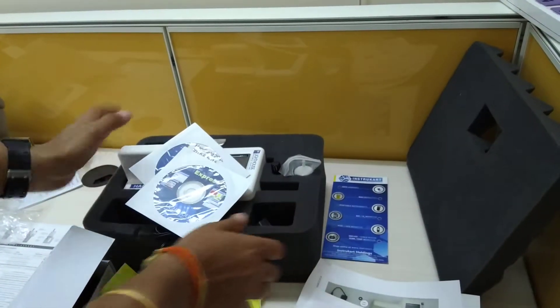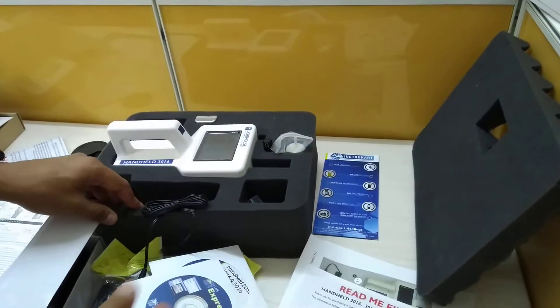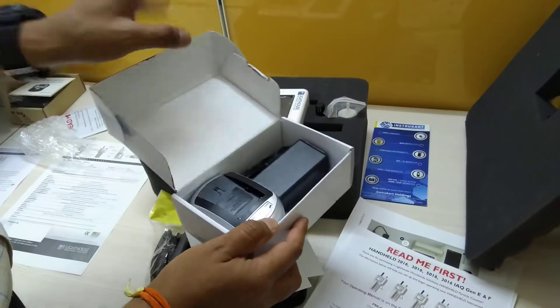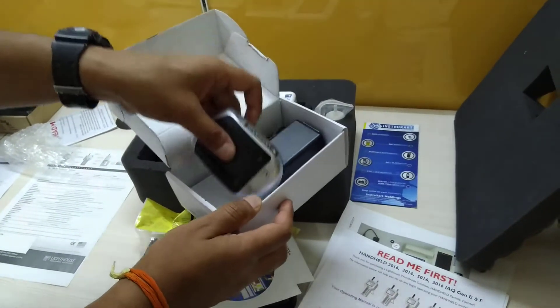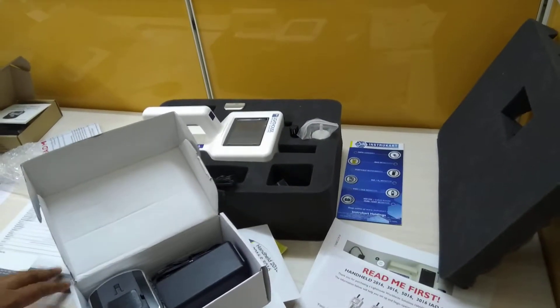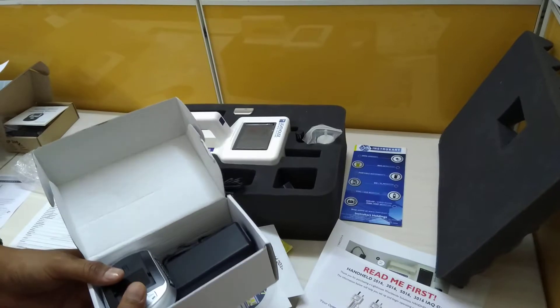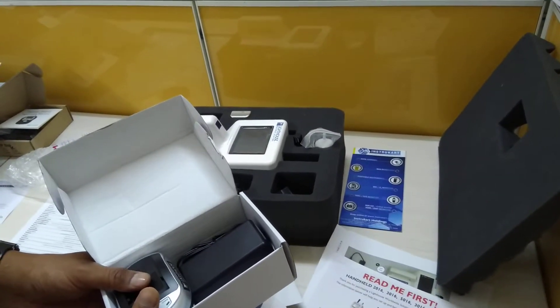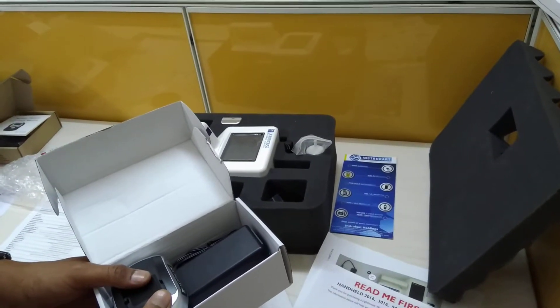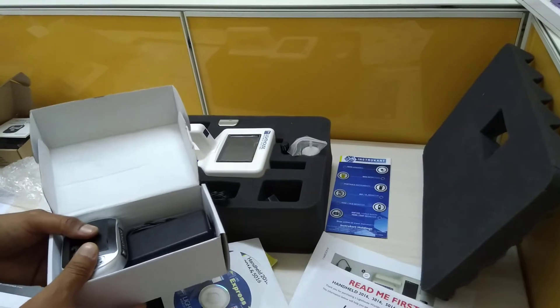The instrument comes in a foam box with a cover. Optional accessories include a car charger, carrying case, isokinetic sample probe with six feet of tubing, additional lithium-ion battery, external battery charger, thermal printer with printer cable, and a printed operation manual.